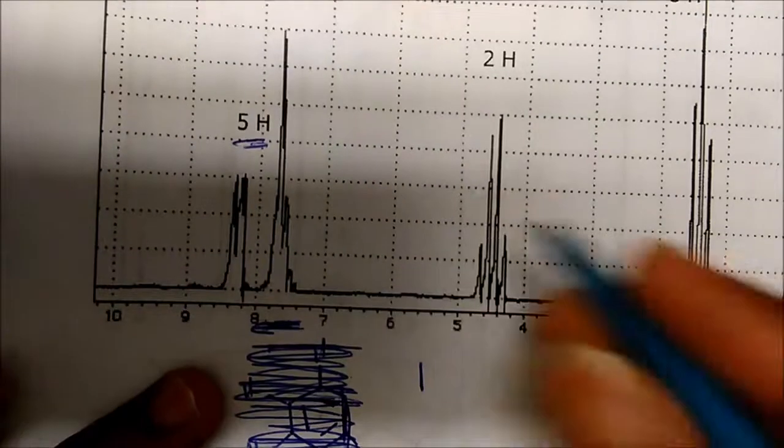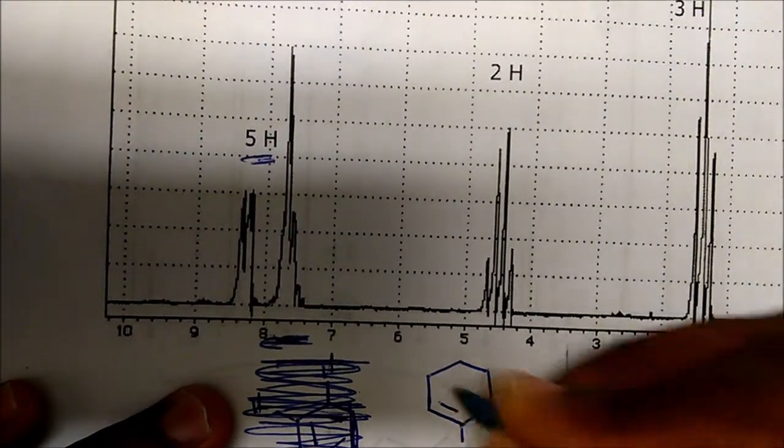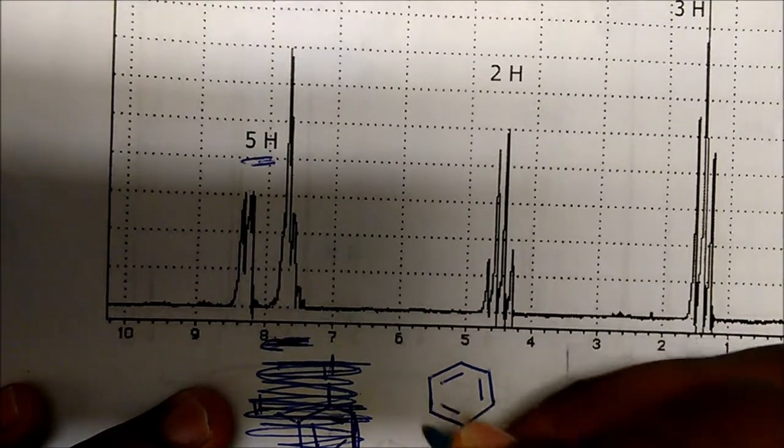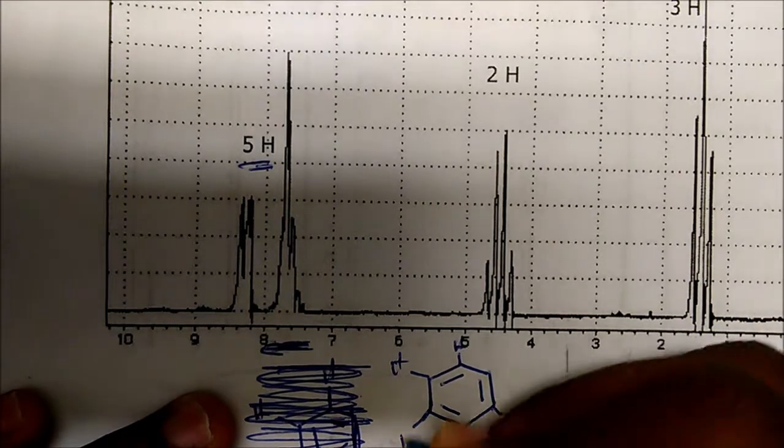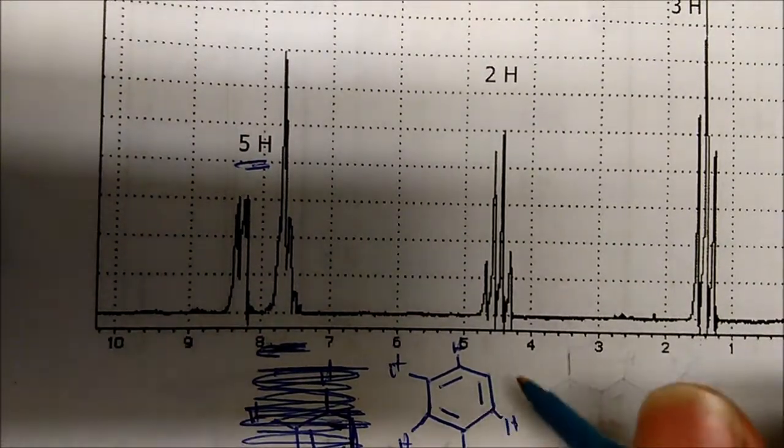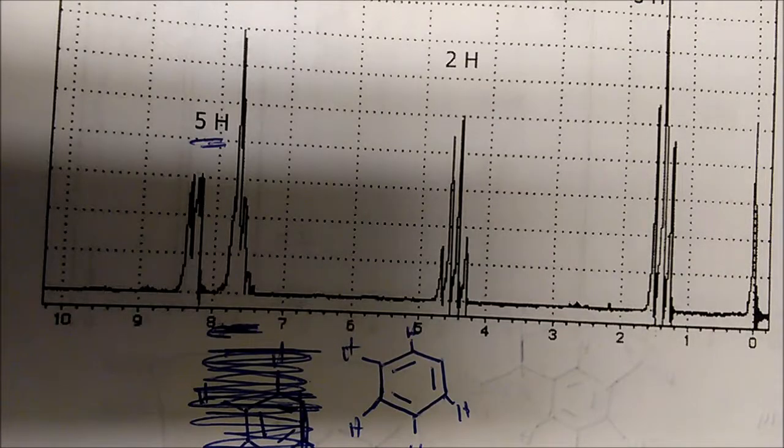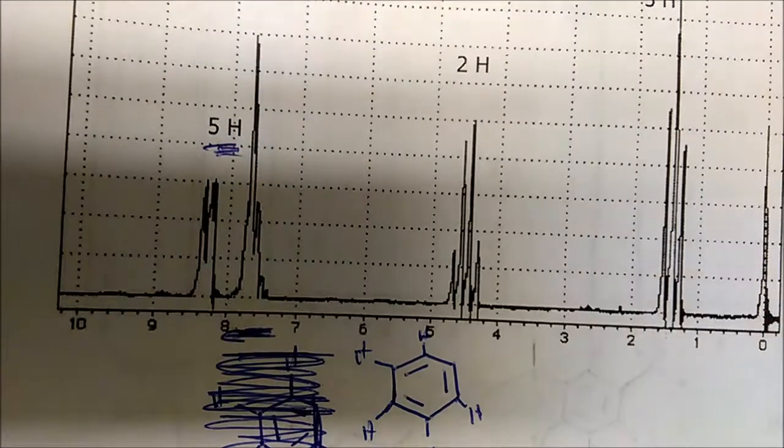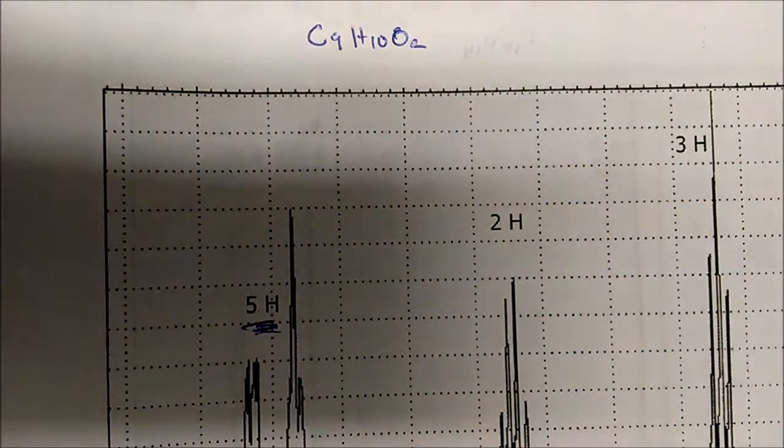Now, this aromatic ring in particular has five hydrogens vibrating, which means that it has to be monosubstituted. And for those of you who are wondering, it doesn't matter where you put your substituted part of the benzene ring. It just so happens that I like to do it in the right upper corner. So this has to have five hydrogens, which is what we see here. Therefore, it has to be monosubstituted. Now, the molecular formula is C9H10O2.